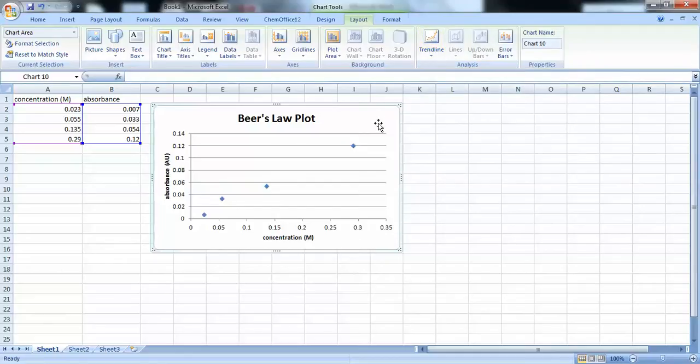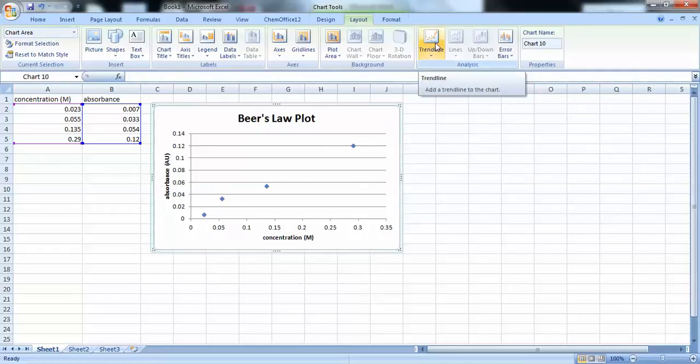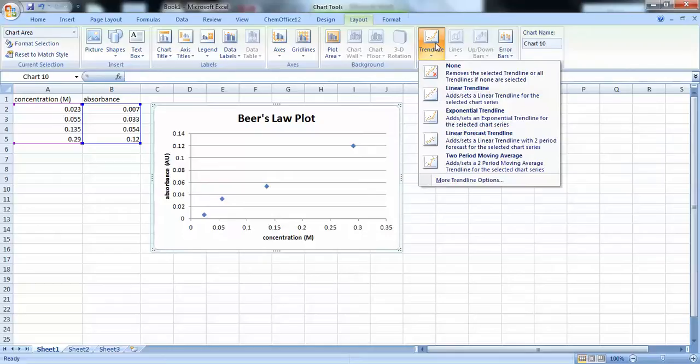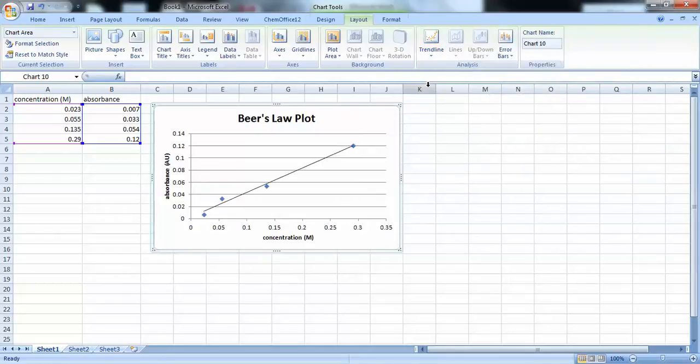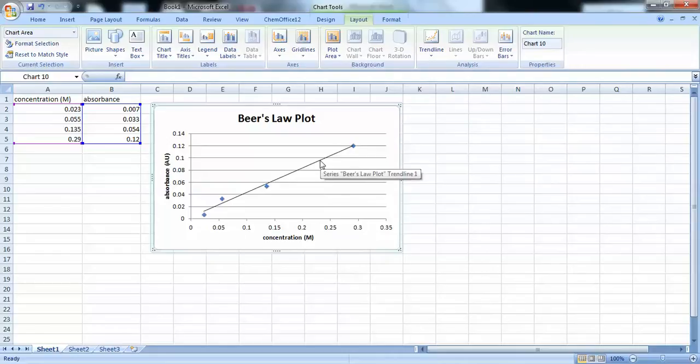So, making sure we have the plot highlighted or selected, let's click on trend line. And we want a linear trend line. And the reason we want a linear trend line is because Beer's Law is essentially a linear relationship between the absorbance and the concentration.